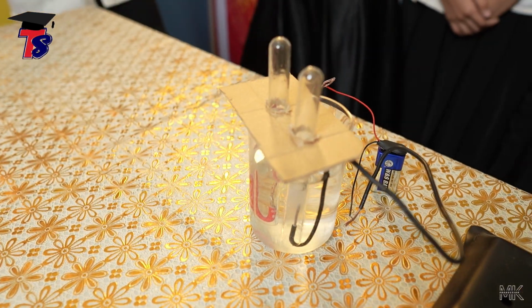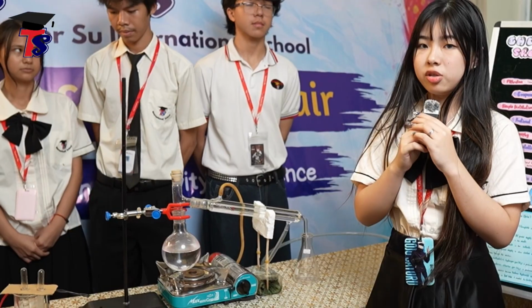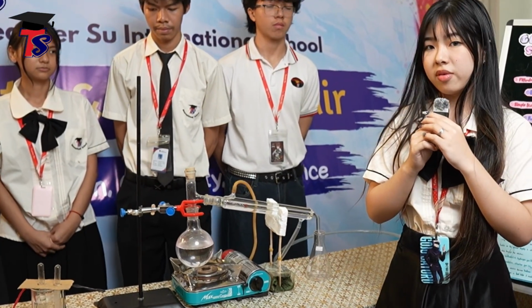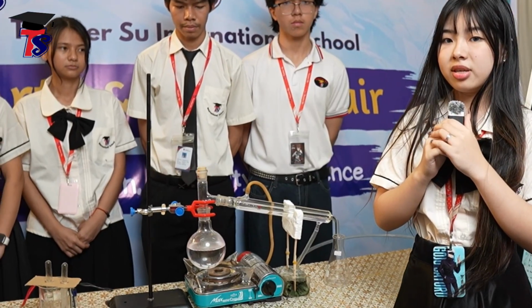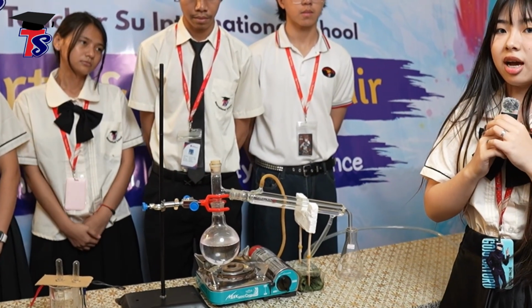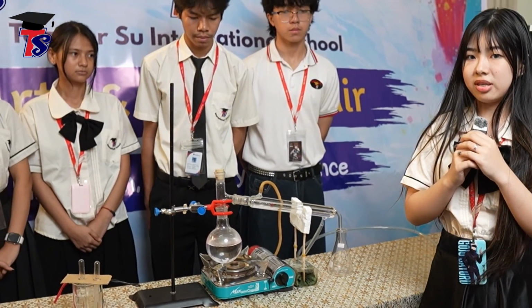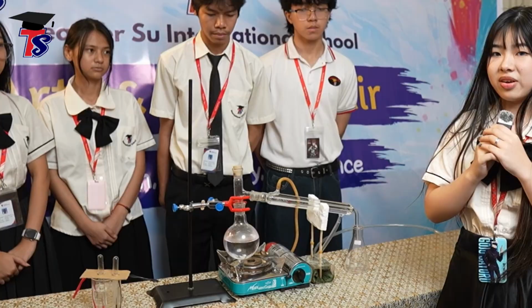So usually, simple distillation is used to separate pure water from seawater in real life. This is a very useful process that is really essential for everyone, and it's used very, very frequently.